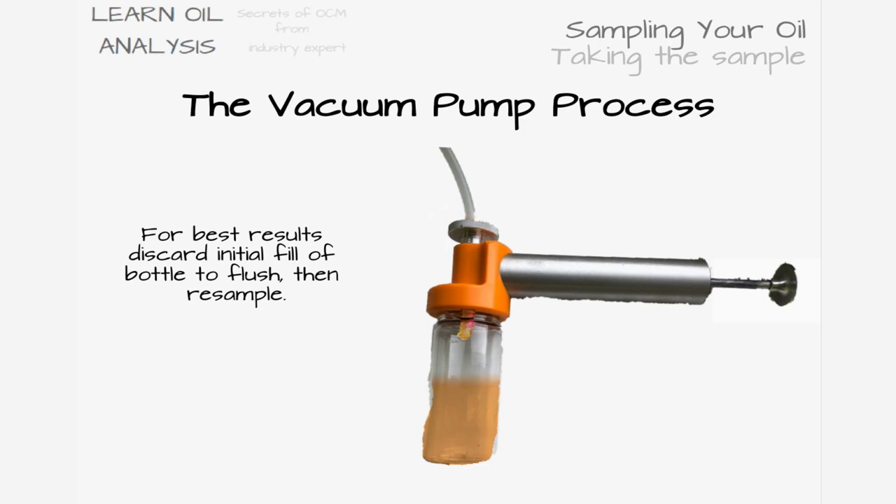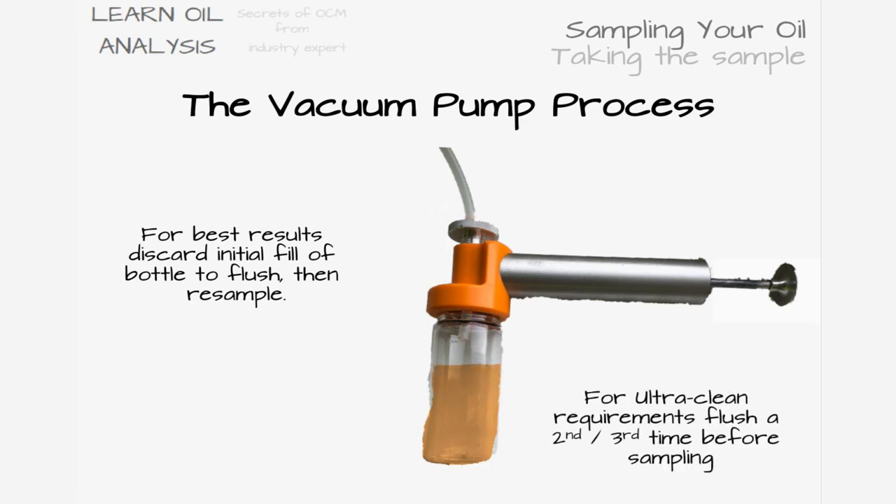When the bottle is about half to three-quarters full, pull the tubing out of the dipstick slightly and begin to release the pump valve to slow the flow. This means the remaining oil in the tubing will fall back into the dipstick and bottle, reducing the chance of oil spillage when withdrawing the tubing. Briefly inspect the sample for any visible signs of contamination such as cloudiness, emulsification, sediment, metal, or water droplets.